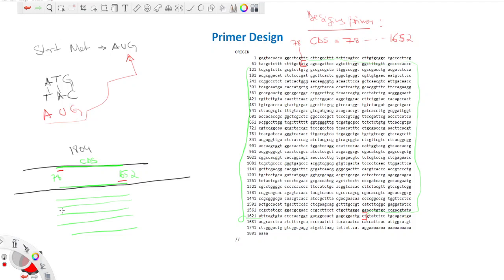There are many ways and many factors that will allow you to select. Sometimes, you may want to select regions that are a little bit further from this region, maybe a little bit down here, just to make sure that you incorporate everything. That is also okay.